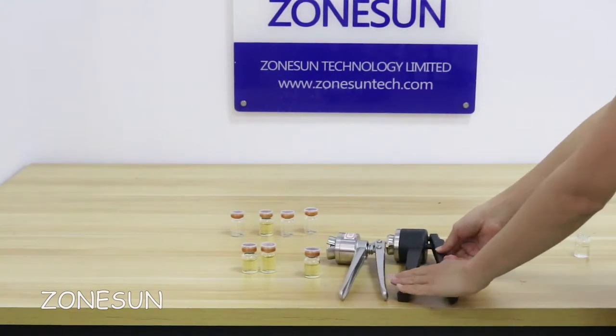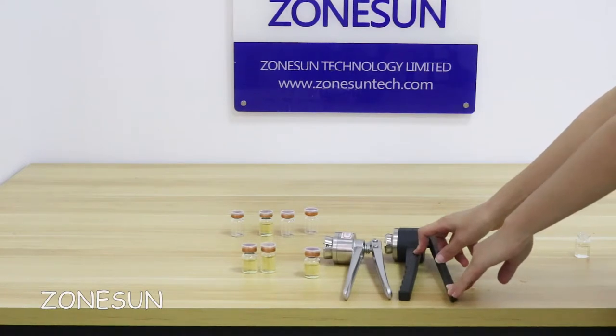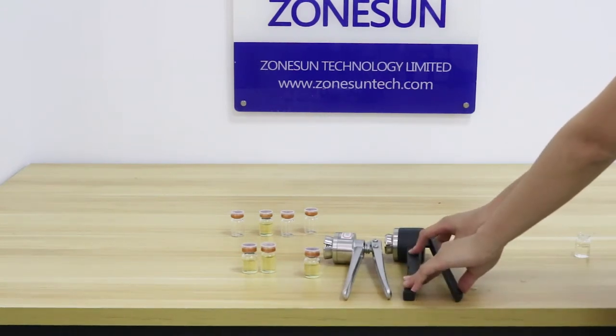Both of the tools, we have the sizes 11, 13, 15, 20, 30, and 32mm. If you need another size, please contact us to custom order.